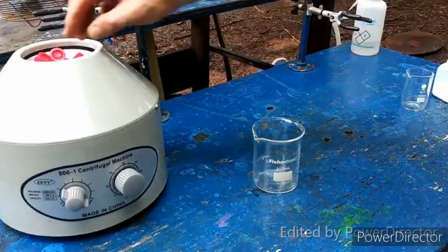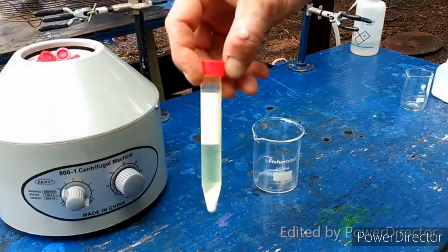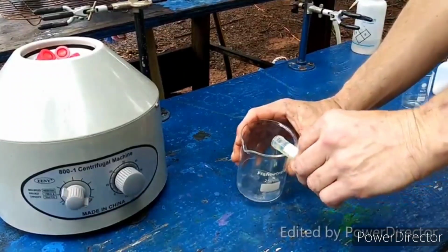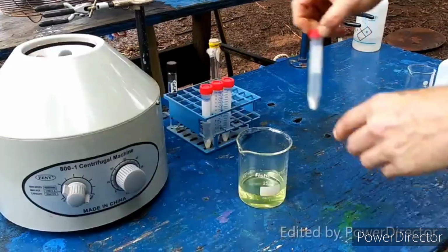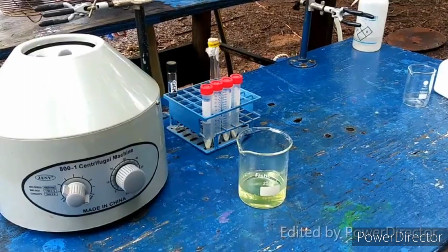Okay, so this is done centrifuging now. Look at that. Very nice. Love the centrifuge, man. Makes life so much easier. Okay. Put that in there. Actually, there's our solution of uranyl chloride. Pretty cool, huh? Not quite as fluorescent as the sulfate was.